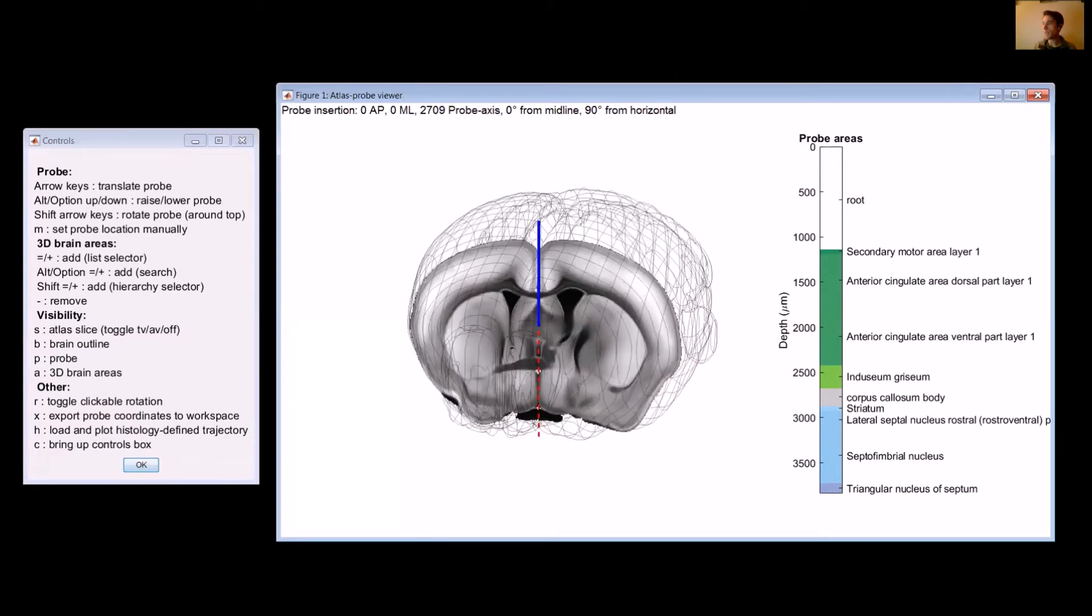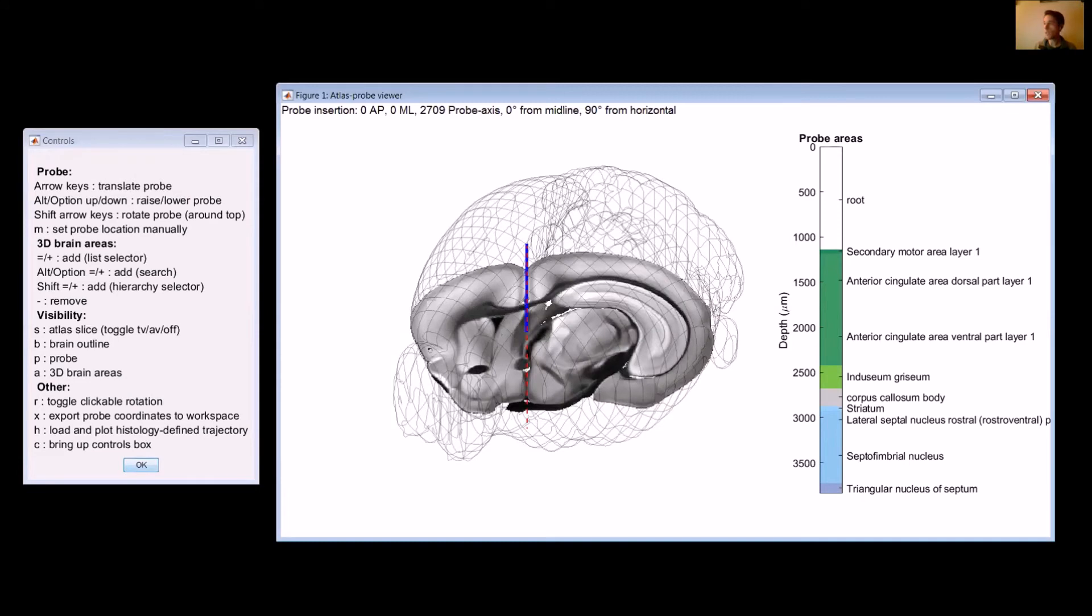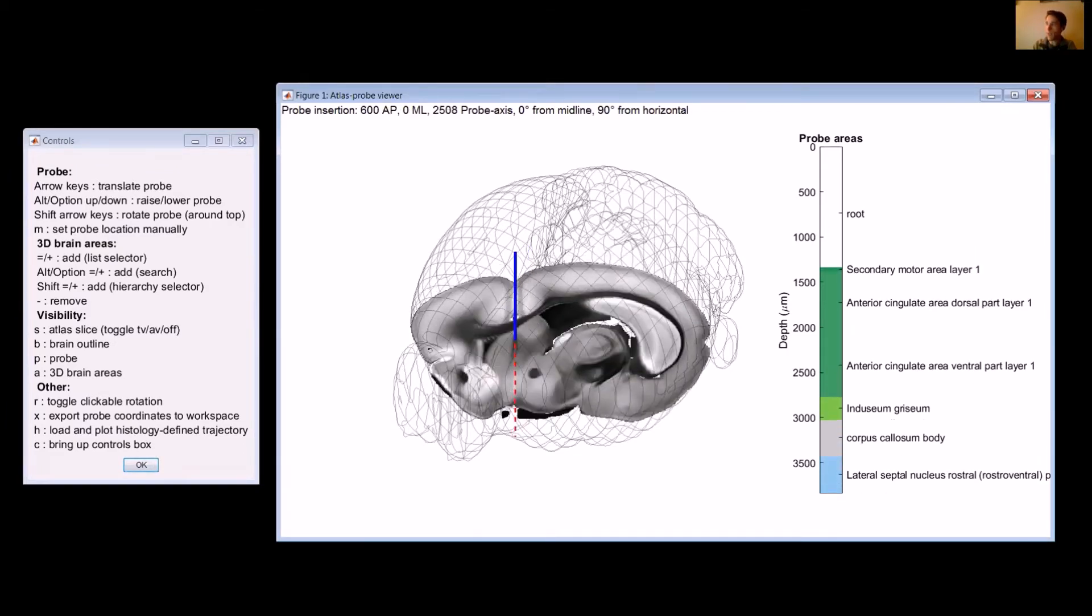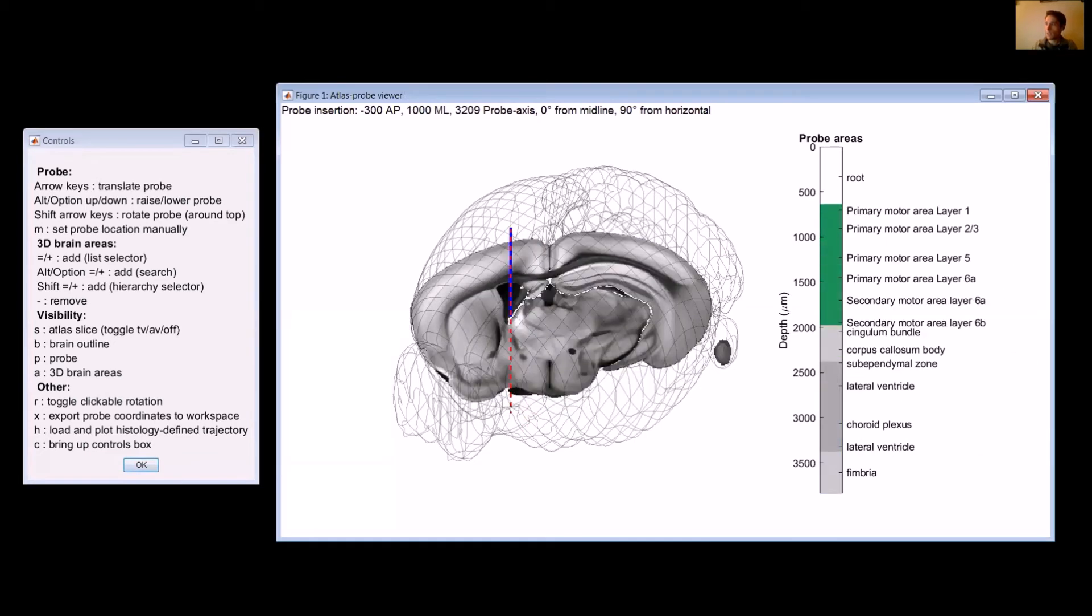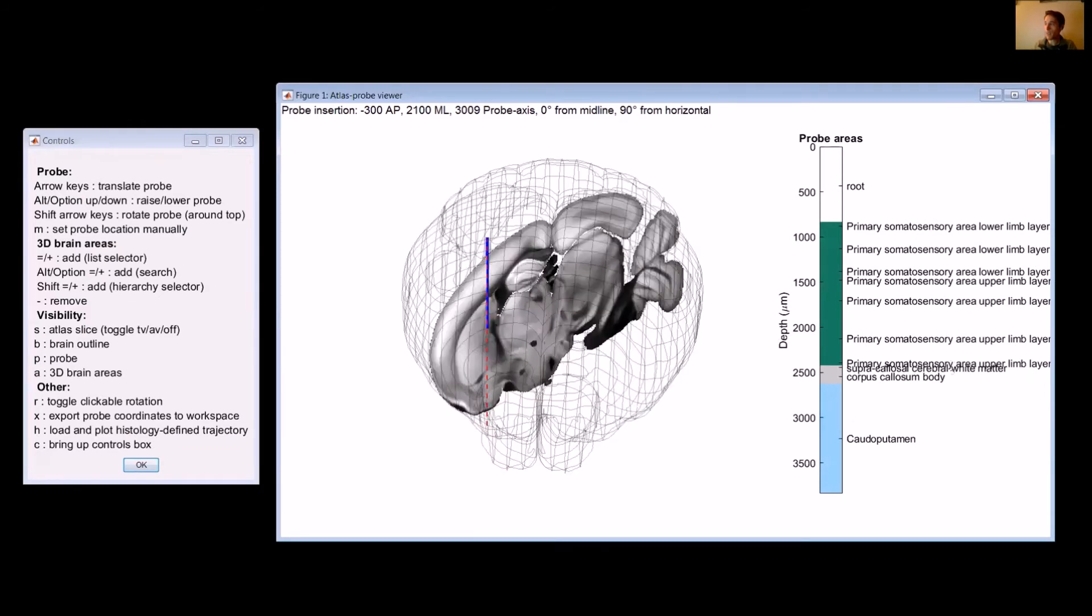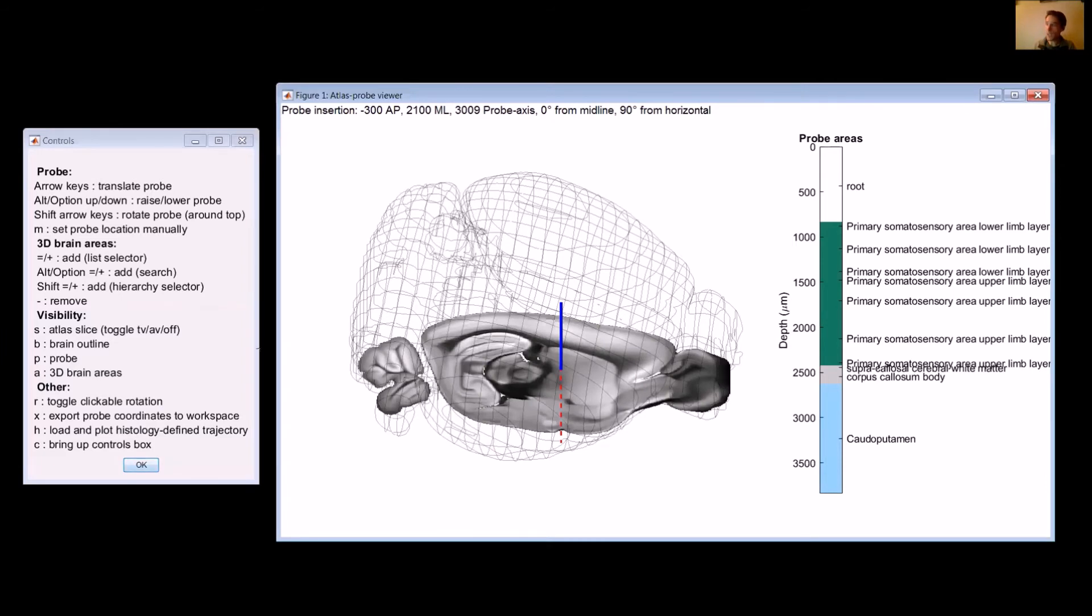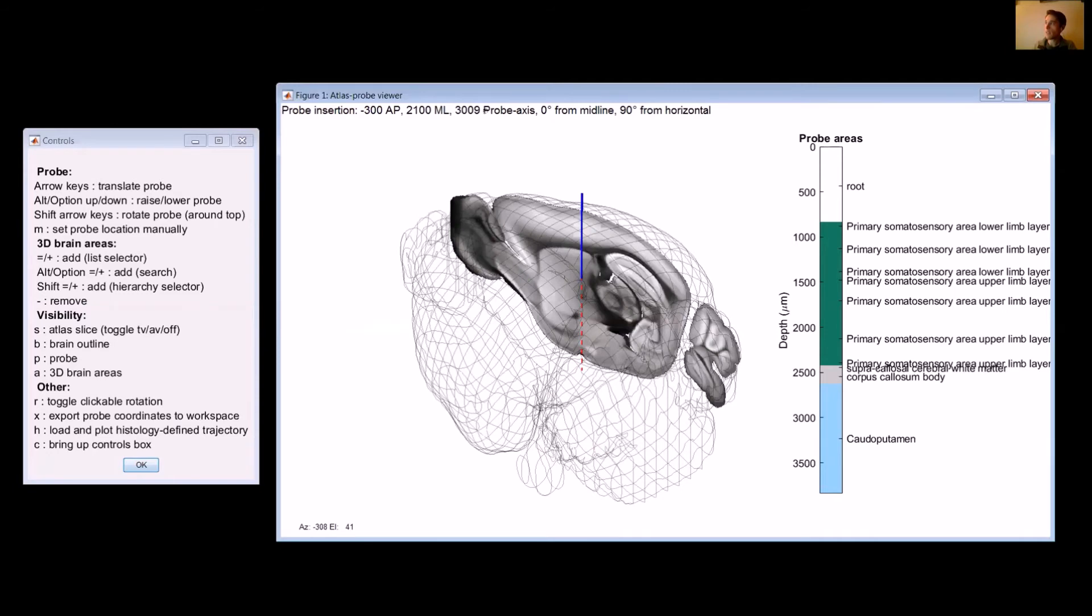Some basic keys are shown up here. This is how you move the probe around. You can move the probe around using the arrow keys. So if I press up, it moves it forward in the brain. If I press back, it moves it backwards in the brain. Left and right, go left and right. So that's how you move it by translating it in space.